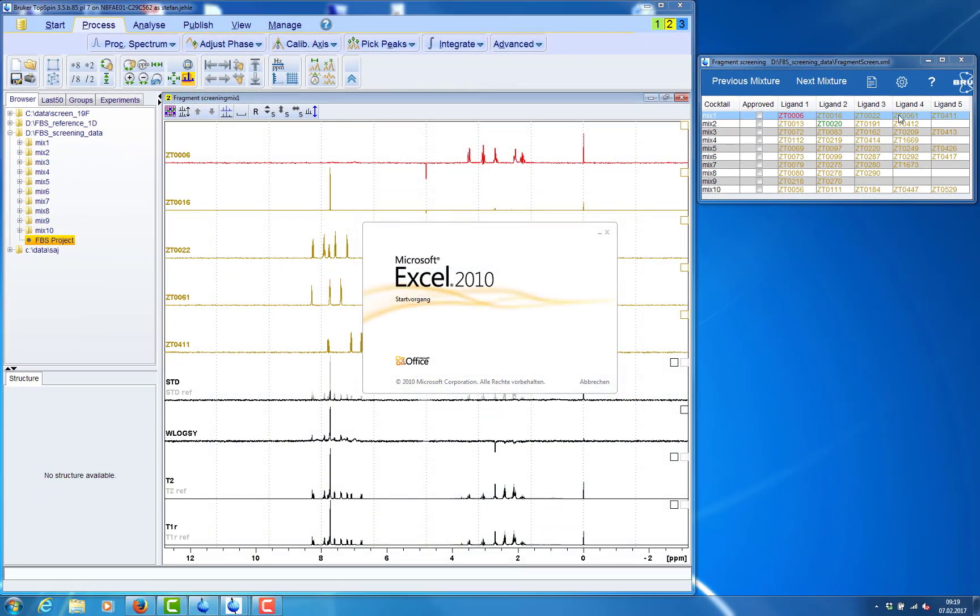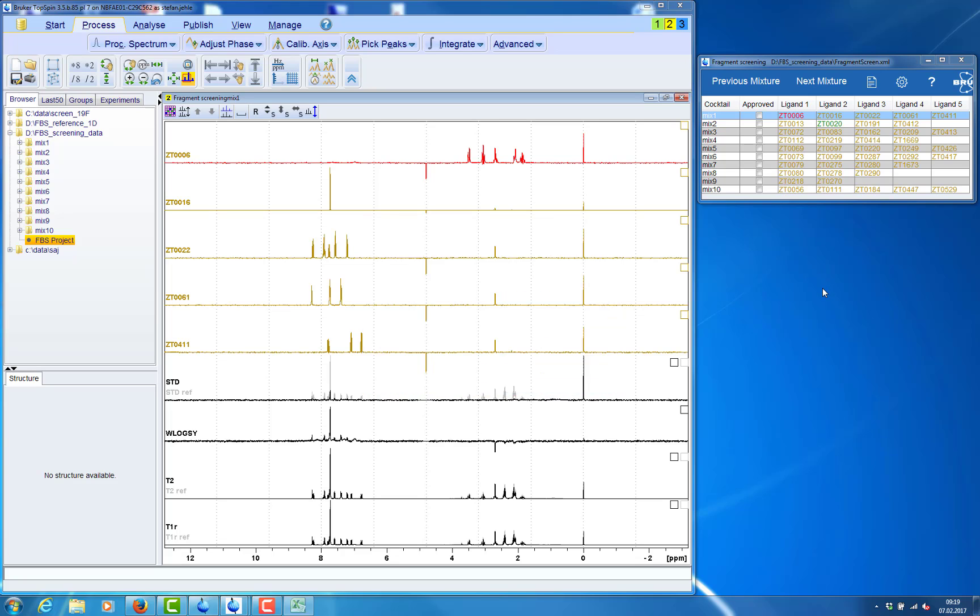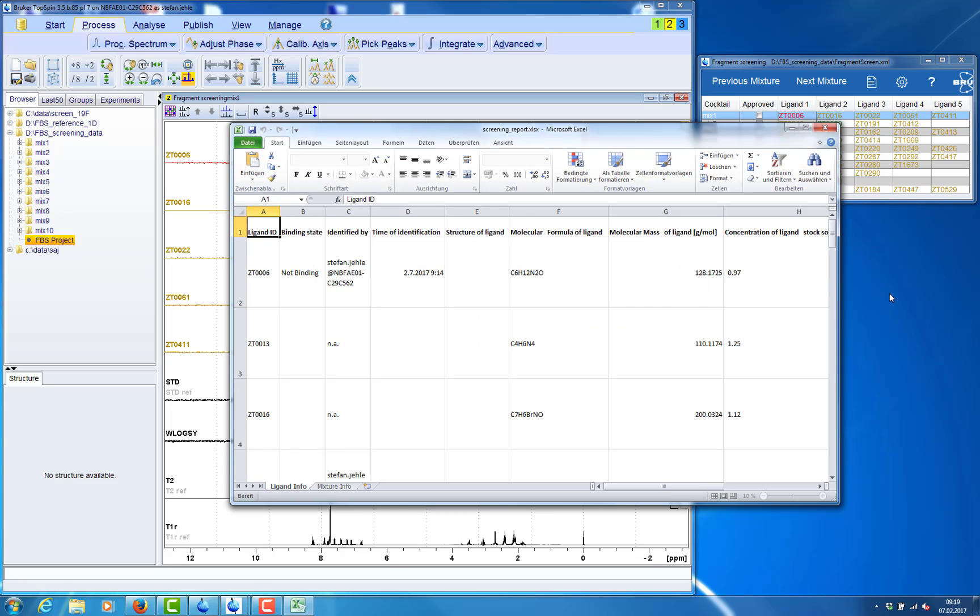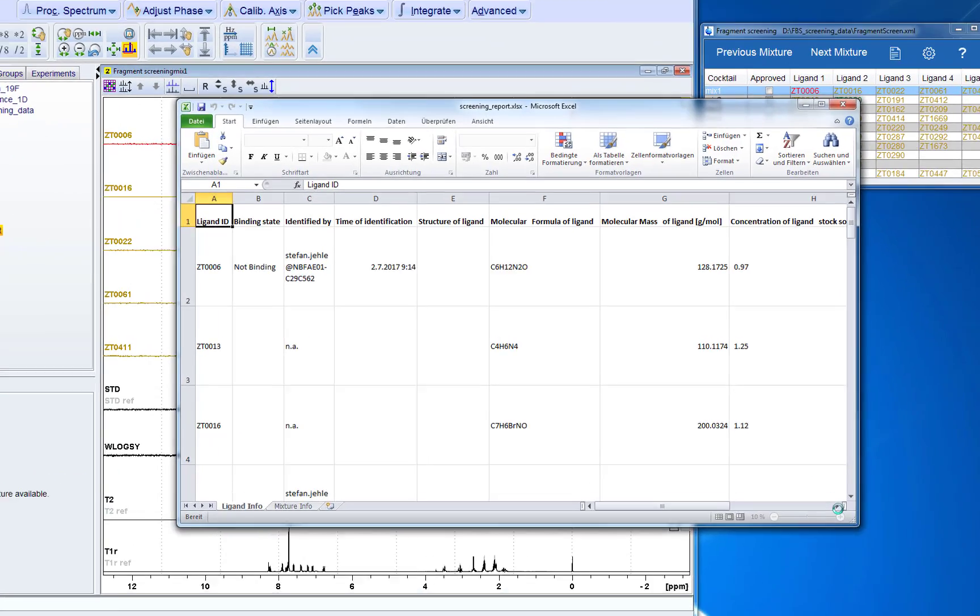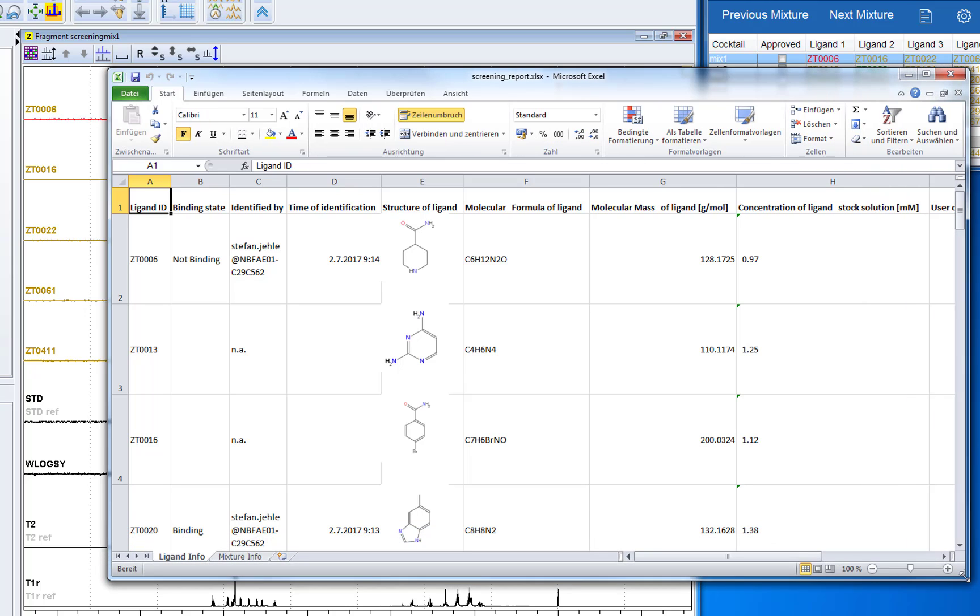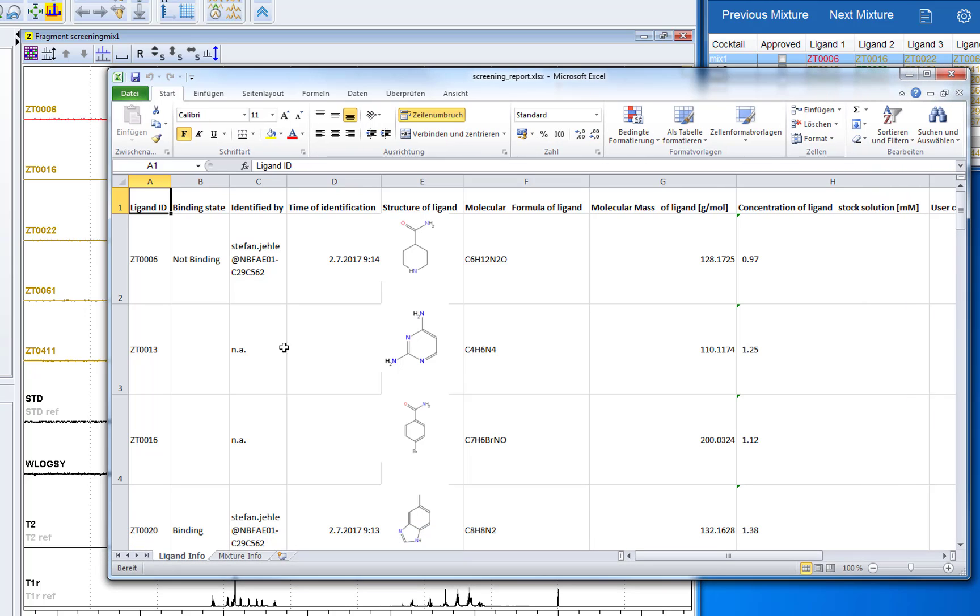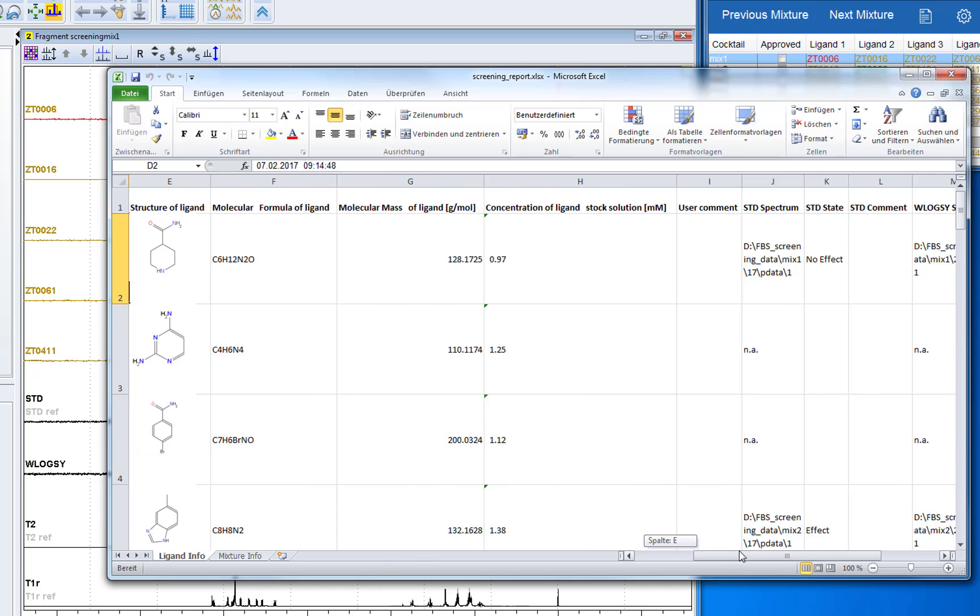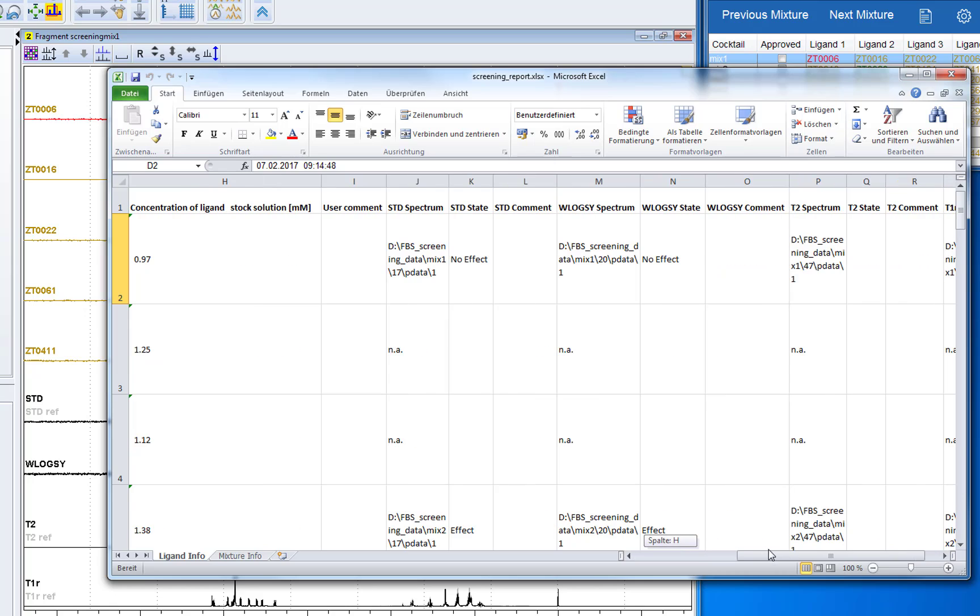This should be suitable for all possible LIMS systems or should be compatible with all possible LIMS systems. In the screening report we can see who has annotated the ligand and at which time and date. So there is a time and date stamp. There is a picture of the ligand and information where the data are stored.